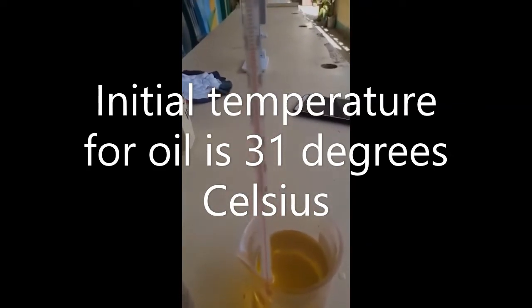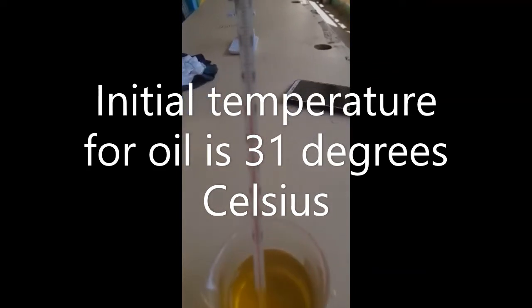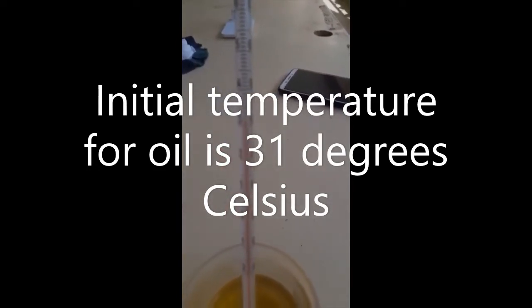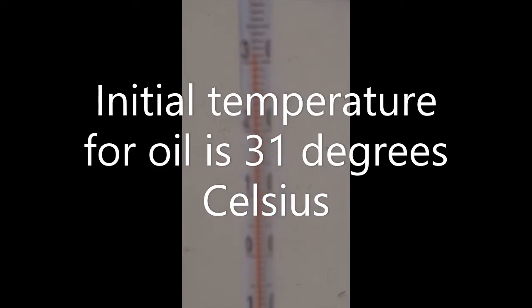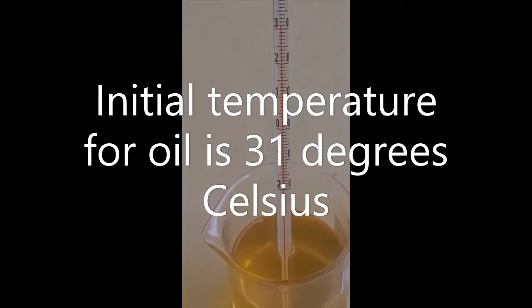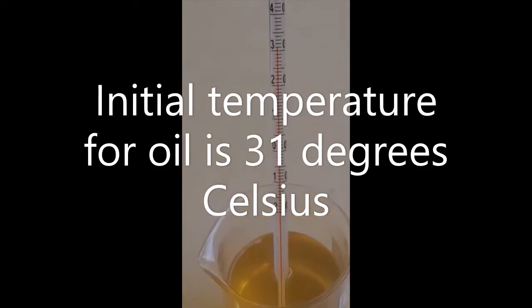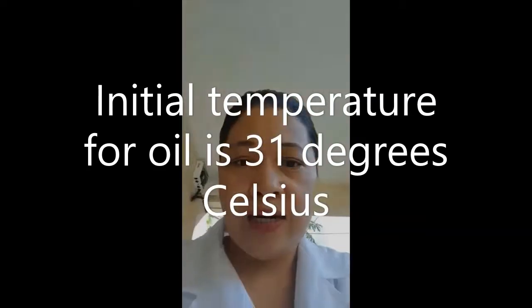Actually it is 31 already, guys. It has passed 30. So let's zoom in. If you could see, 30 and then 1 line more. That's your initial temperature of your cooking oil. That's 31 degrees Celsius.